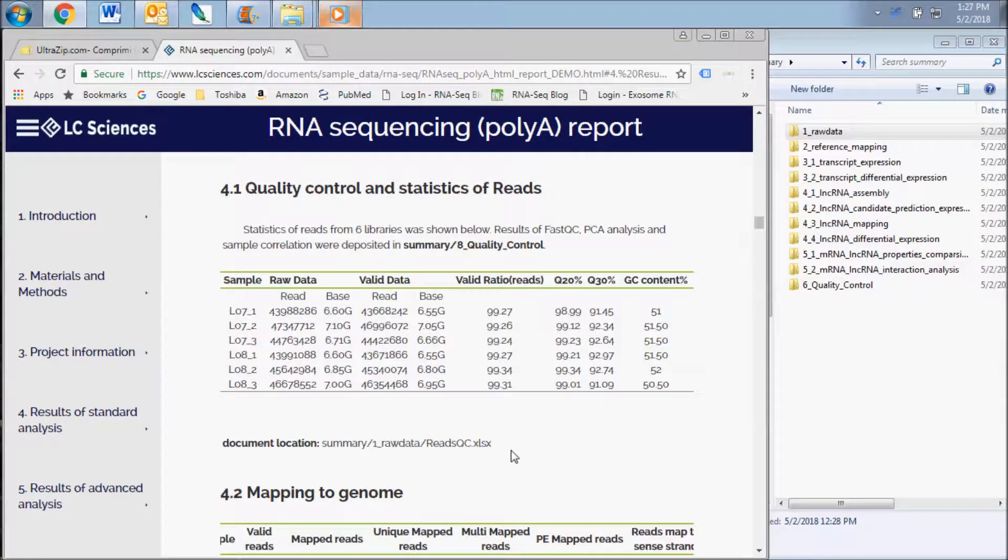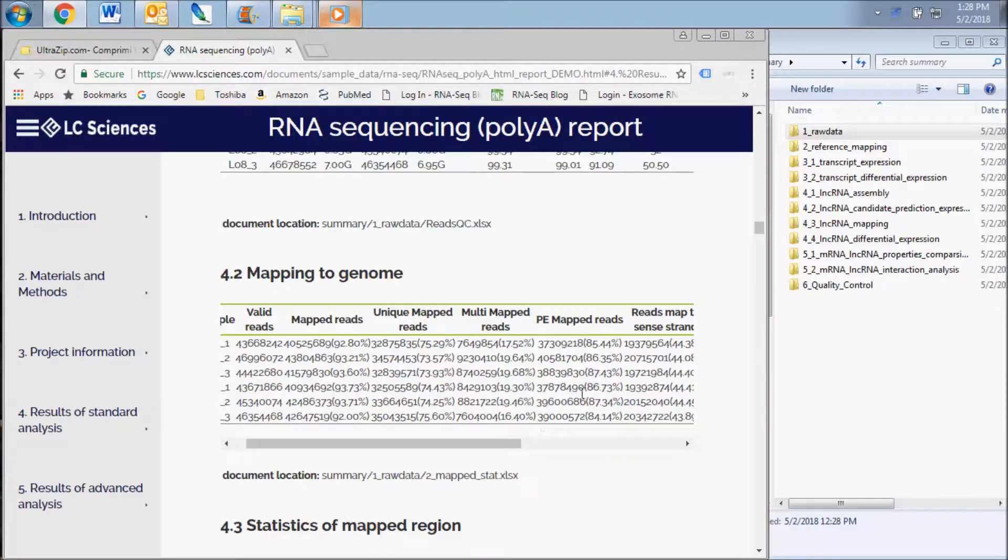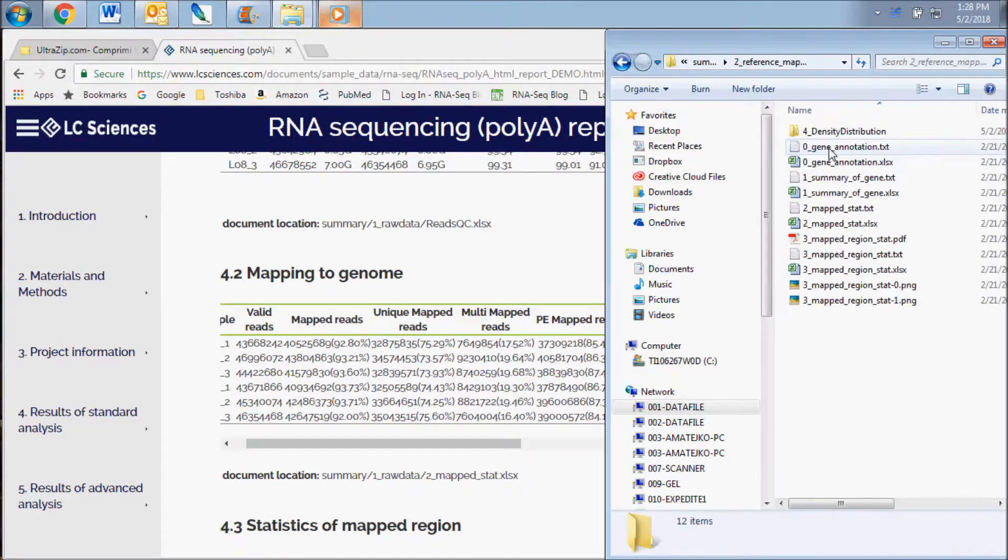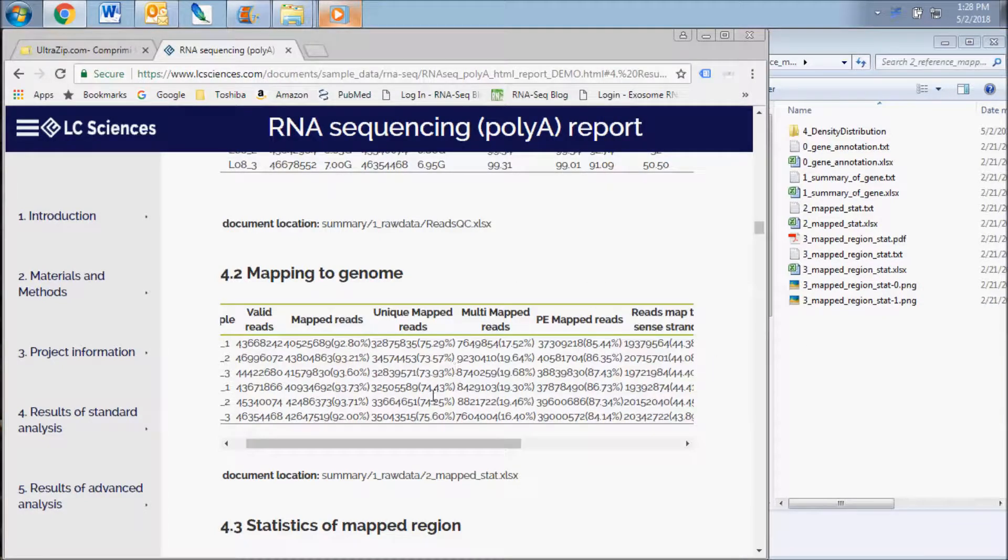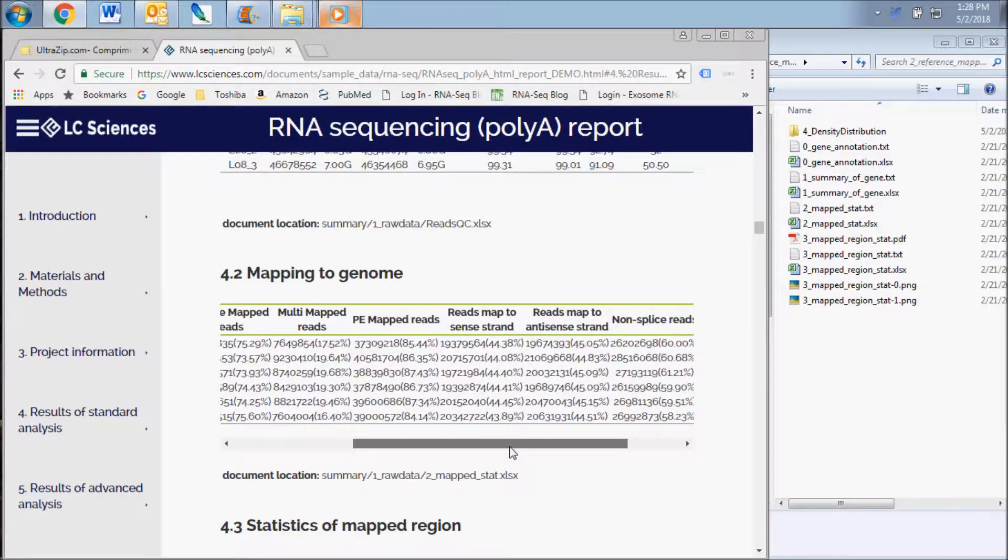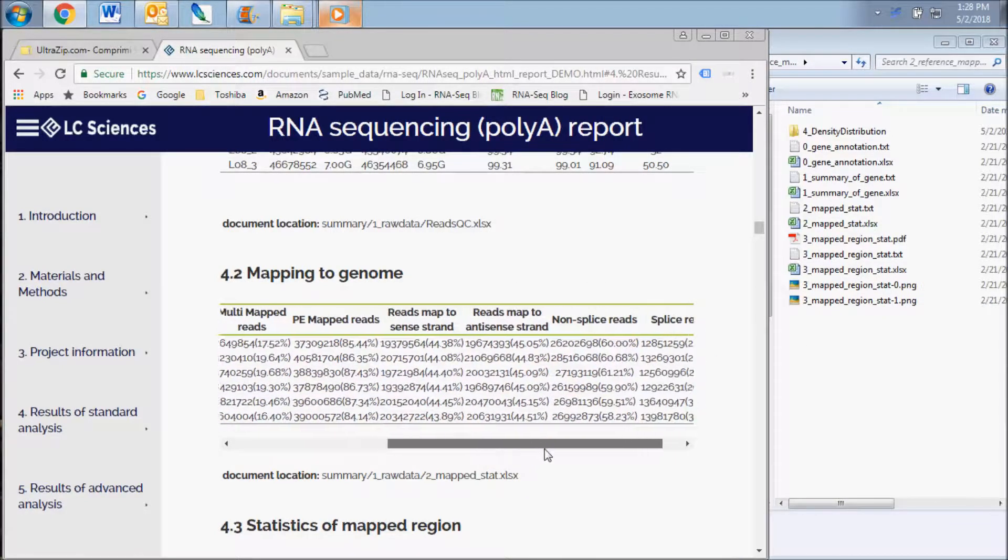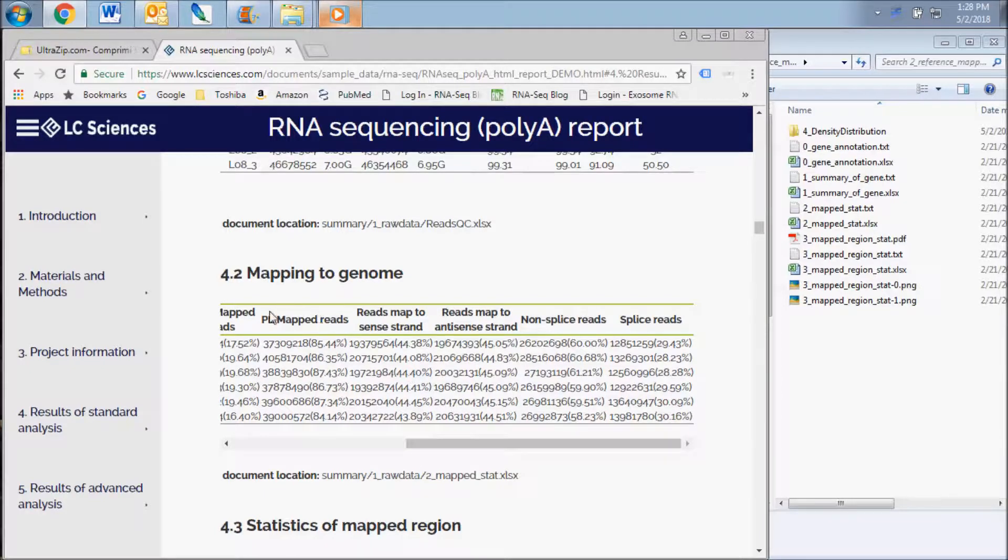The next results subsection displays data contained in the reference mapping folder. This includes the read mapping data, mapping rate statistics, and the read localization on each chromosome. Here you will find a table of unique and multi-mapped reads, sense and antisense strand reads, and splice reads.